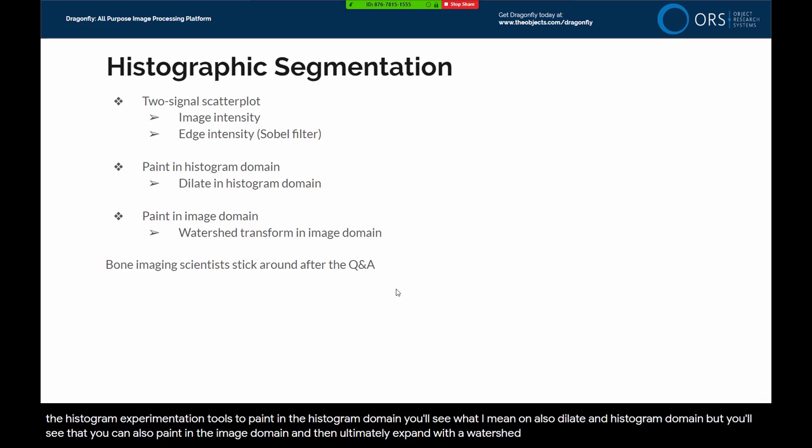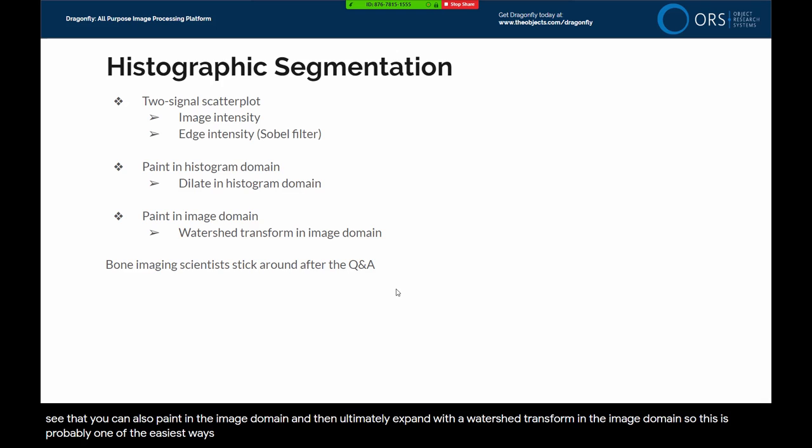This is probably one of the easiest ways to apply a watershed transform for a full image segmentation in Dragonfly.